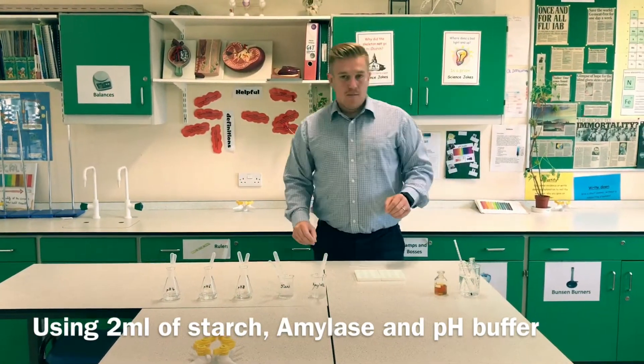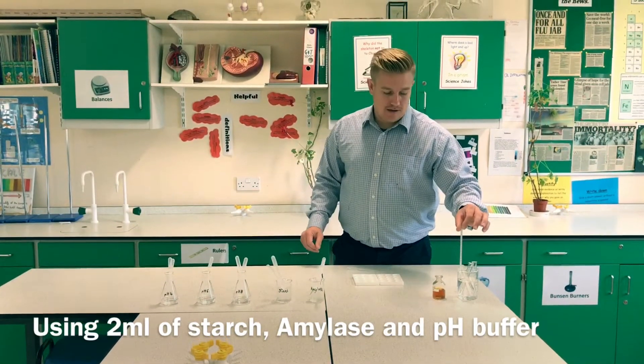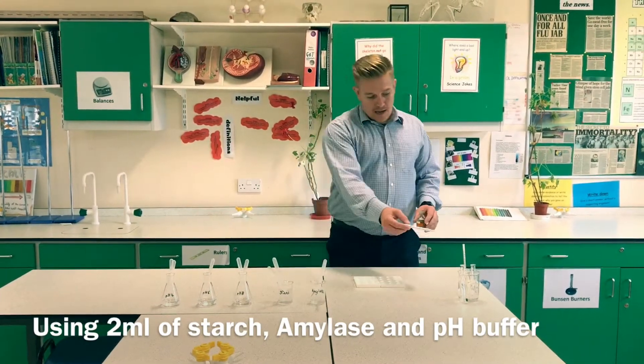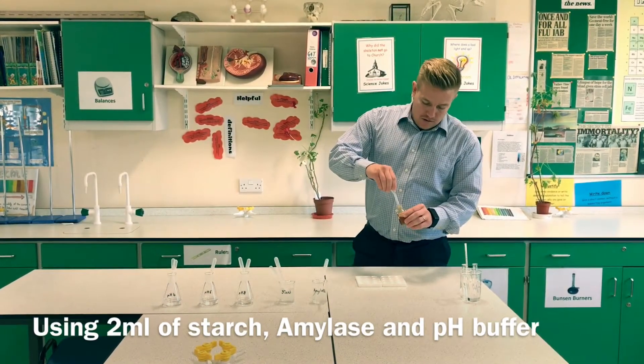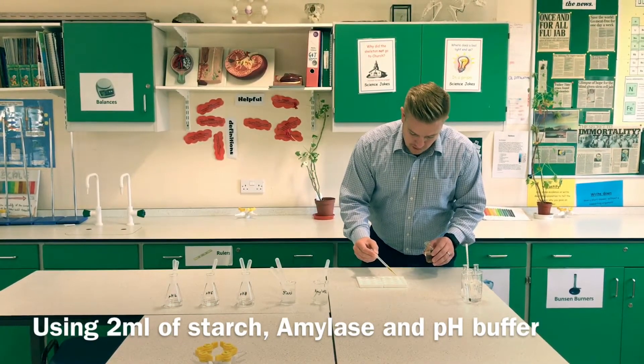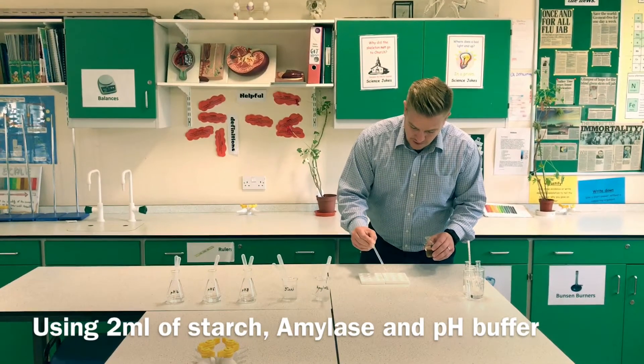While I'm reaching a steady 30 degrees, I'm going to prepare my spotting tiles. To prepare my spotting tiles, I'm going to place a dot of iodine in each section.